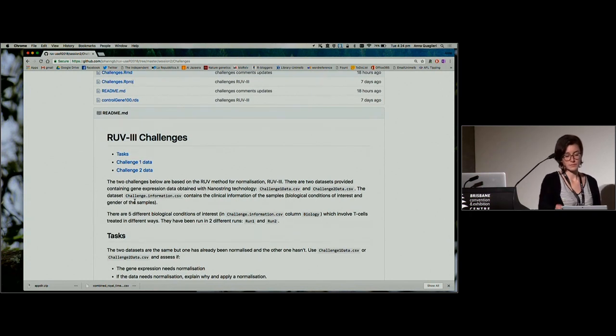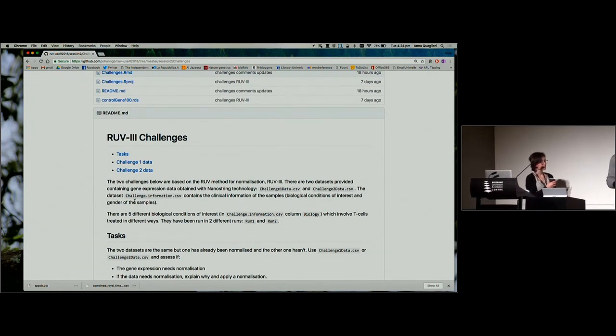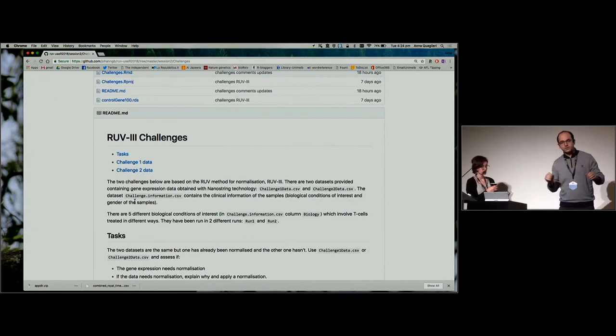And we are hoping that the rest of the genes are right. Usually, because I designed this platform, I normalized 8,000 samples from different studies. Usually using RUVt, using all genes, and K max works, but it's not the case for all. You need to define the control genes and K, get your positive control right, and then you should be pretty sure that the rest of the genes are correct.